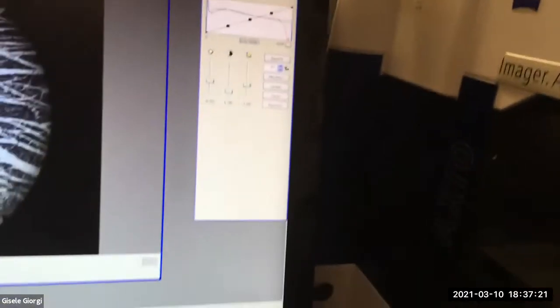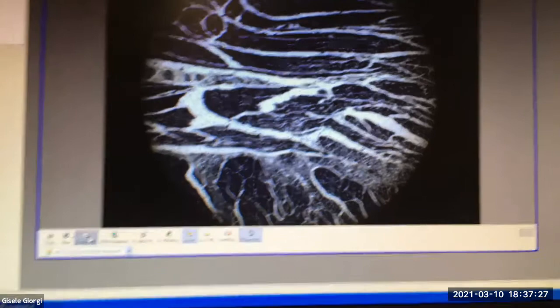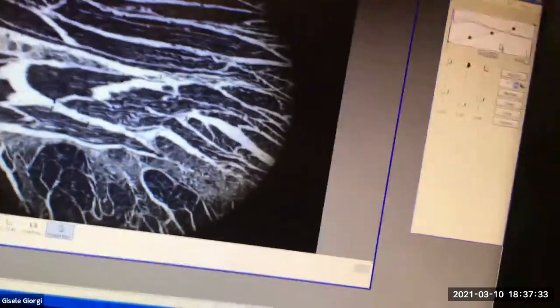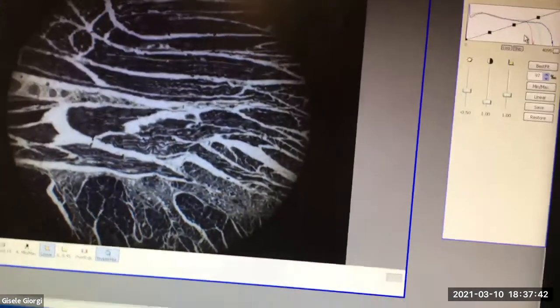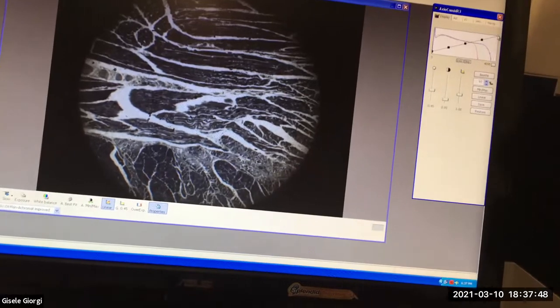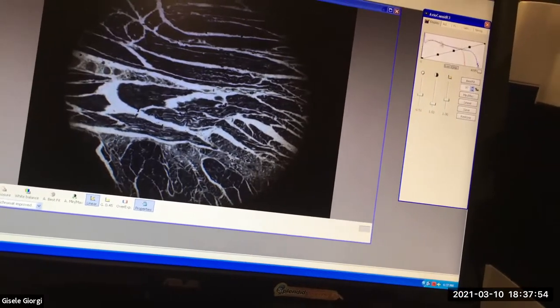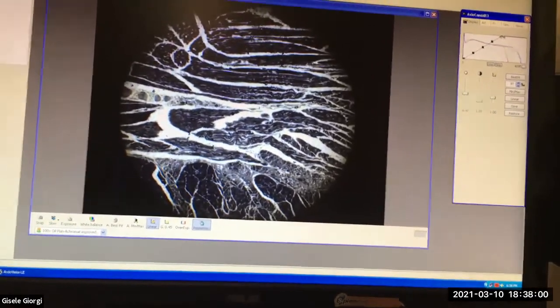And then I would look over here at the histogram and go, that's not really good. Let me fix it a little bit. And I'm fixing it by playing with the light, but I could also play with the exposure time. It's just quicker while I'm demoing to bring the light down a little bit. I want to show you a contrast stretch. Whoa, that's ugly. It's not necessary because actually, I've saturated the black end over here, which is not good, but I'm doing kind of good on the white end. I don't really need a contrast stretch on this image, but okay, here it is.